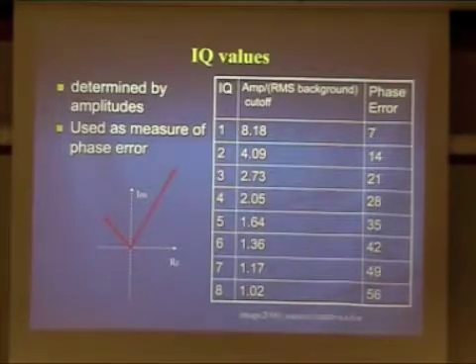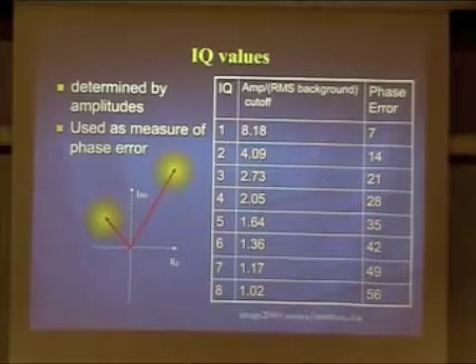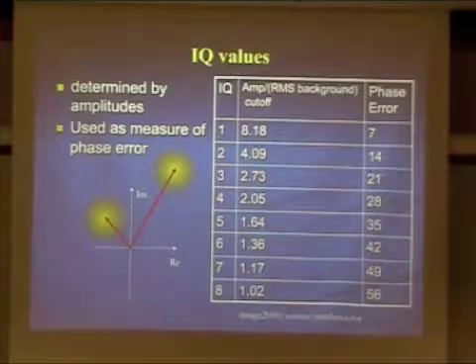So how is this figured out? Think about it this way. So this is the amplitude. We have amplitude, something that's very strong. Here's something that's weaker. Let's say that the natural distribution of your information is within a Gaussian hill, like this, surrounding the endpoint of this.